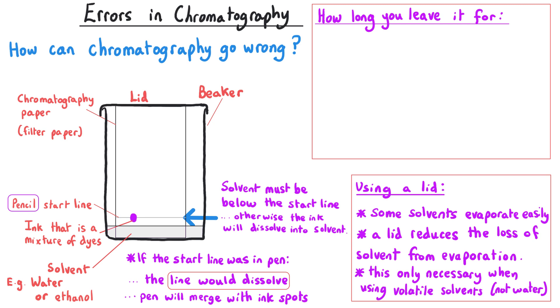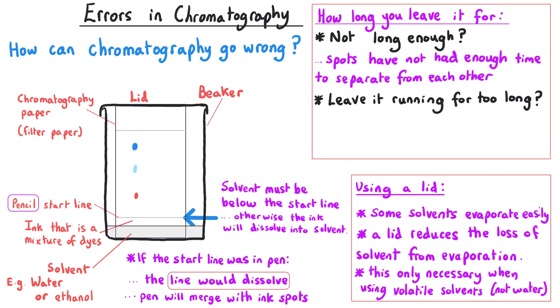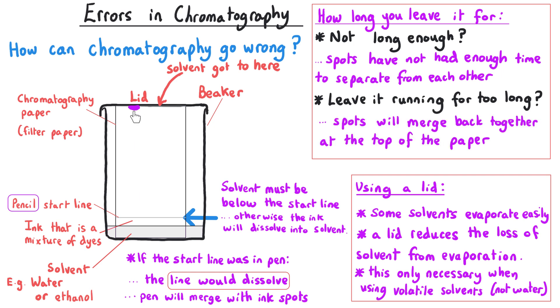The final type of error is to do with how long you leave the experiment running. We need to leave it running long enough for the solvent to have risen far enough up the paper to allow the spots to travel different distances — we're trying to get the spots to race up the paper. If we don't leave it long enough the spots won't have separated. But the opposite is also a problem: if the solvent travels all the way to the top and you leave it running, all the samples will eventually reach the top and merge back together again, so you won't be able to identify them.